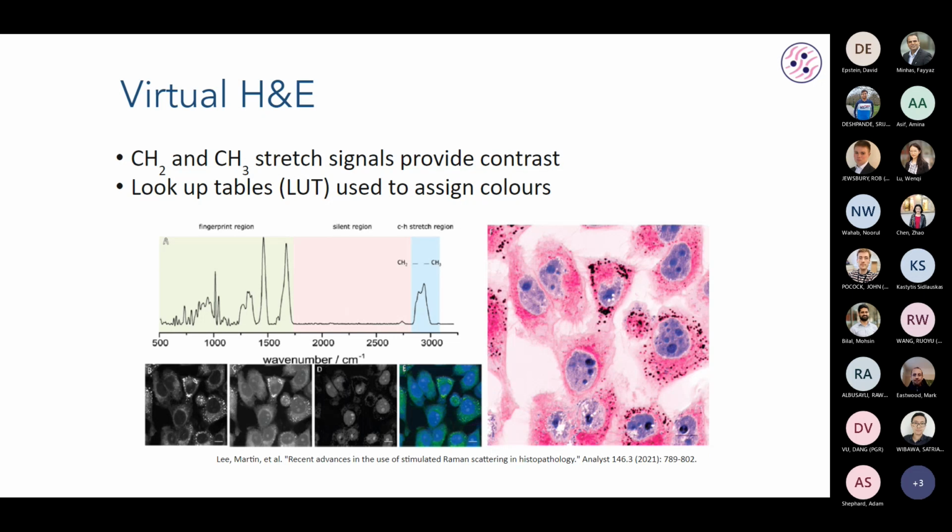So if there's no staining, then what's in the dark spot in the image? Is that simply an artifact, or something else? On the big image, the black dots. Yeah, I think that's just some particular colour corresponding to a particular signal in the images down here. What they did, as I understand it, is they took an image using Raman spectroscopy and they assigned false colours, right?